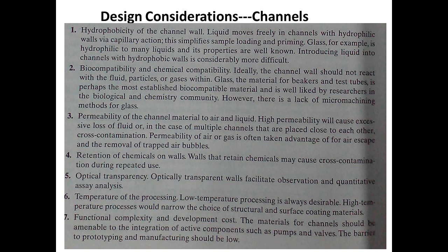And temperature of the processing. Maybe you need it to be low temperature. It depends. High temperature processes will narrow the choice of structure and surface coating materials. So you need to consider this also.